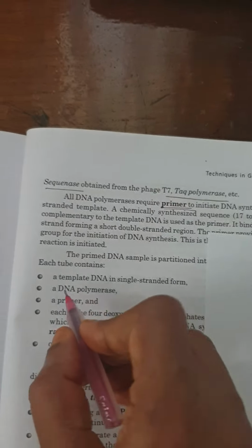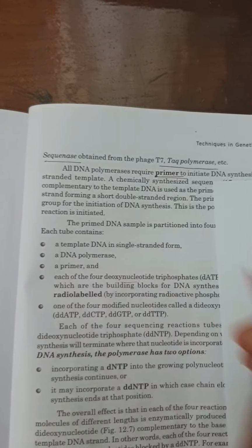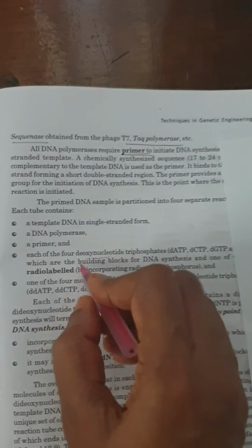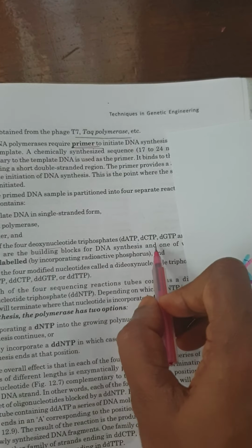Next we have to add DNA polymerase. We need to add DNA polymerase here also. Then we have to add primer. Primer is also important: plus primer, plus primer, plus primer. Next we have to add the four deoxynucleotide triphosphates, dNTPs.